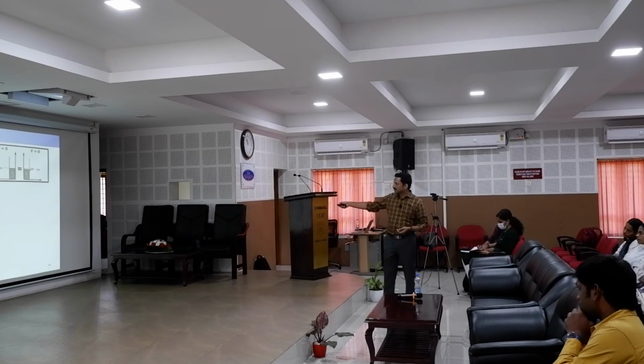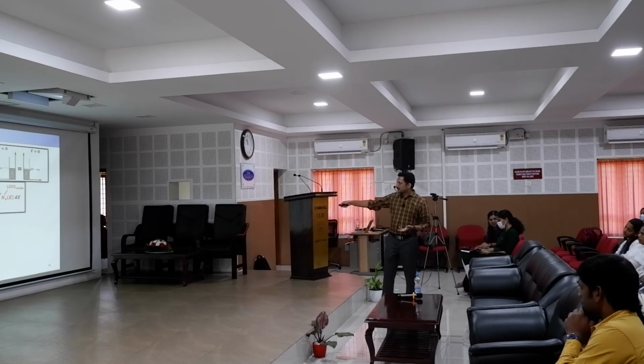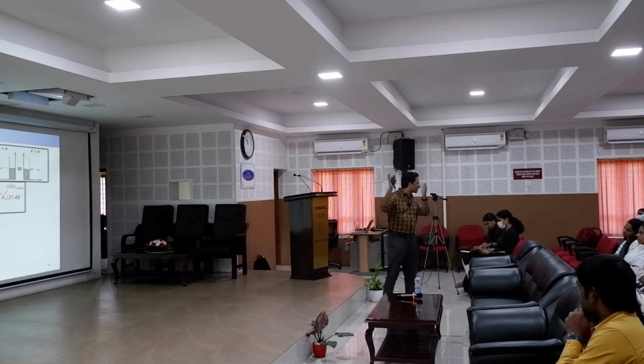That's what is actually shown here. This is the tip and this is the surface. For the electrons to pass, there should be some available states there. And this is from the tunneling equations only. This is the density of states available here, because it is like a theater we are opening. People are waiting outside. A movie theater is opening. If it is already houseful, nobody can enter inside. That is the valence band. If it is empty, we all can go inside, and that's the conduction band.